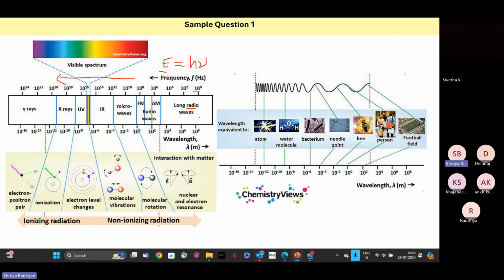So the radio waves used for NMR spectroscopy are very low in energy, so it does not harm the sample in any way. But as you gradually increase the energy, you tend to destroy the sample. Like suppose X-ray. In X-ray crystallography, X-rays are supplied and the electron can be completely knocked out of the compound.